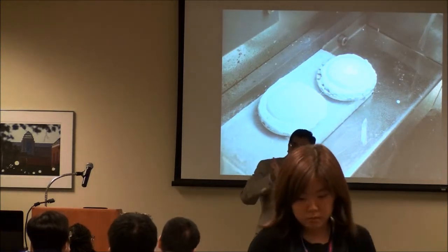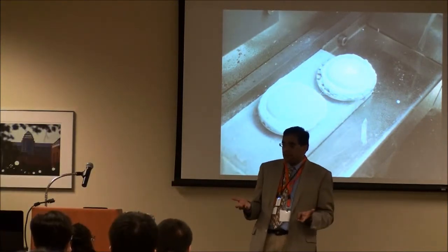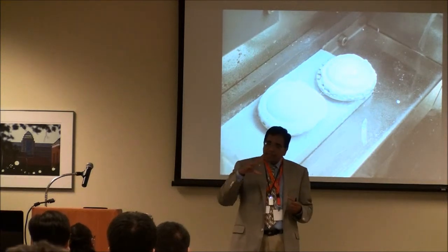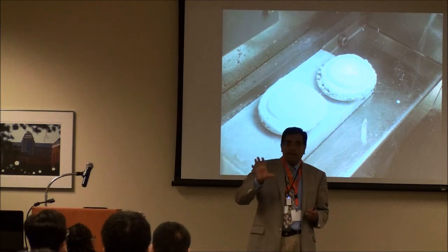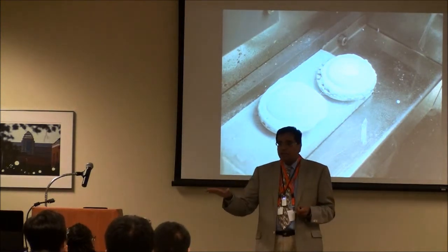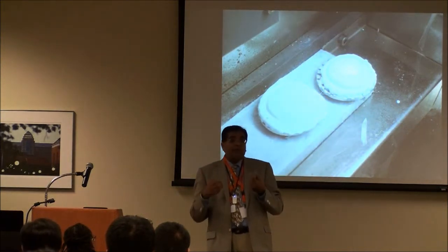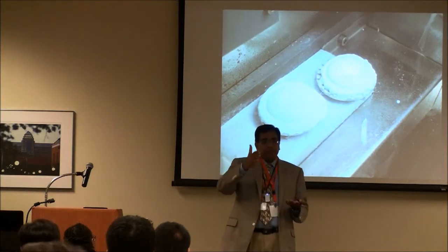Then they go through a stainer process called H&E staining, hematoxylin and eosin staining. After the staining process, the slides get cover slipped with the patient name and the identity of all the material, and go to the pathologist, and the pathologist actually looks under the microscope and makes a diagnosis. So did I go through each step? Okay.